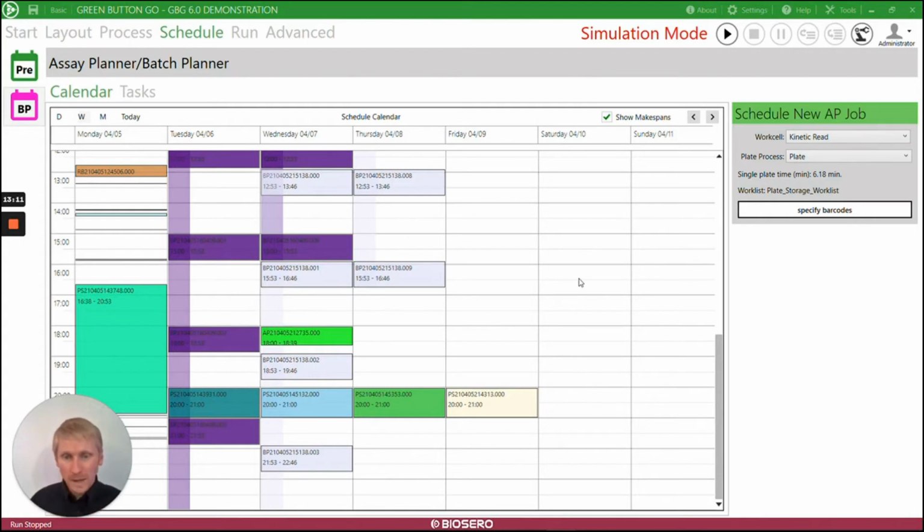And again, I just really want to highlight the fact that this calendar now is showing all the different runs that are scheduled to take place, regardless of what tool was used to add those. And we look forward to adding other scheduling capabilities here in this schedule tab.